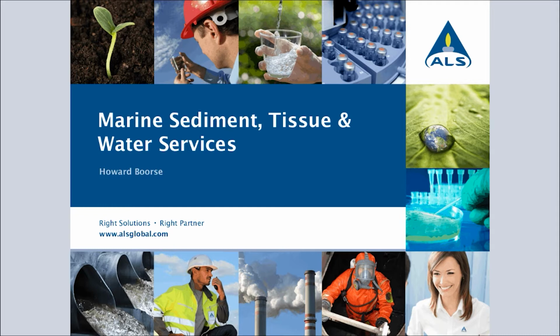Thanks, Malia. Hey, thanks everybody for joining. So today we're going to talk about analysis of contaminated sediments and related matrices for marine and freshwater environments. Contaminated sediments are of interest because they present a risk to the environment and human health and are a contributing factor to fish consumption advisories.